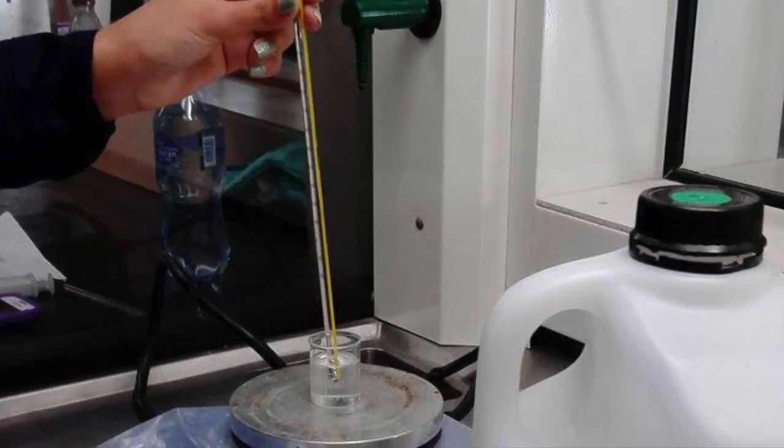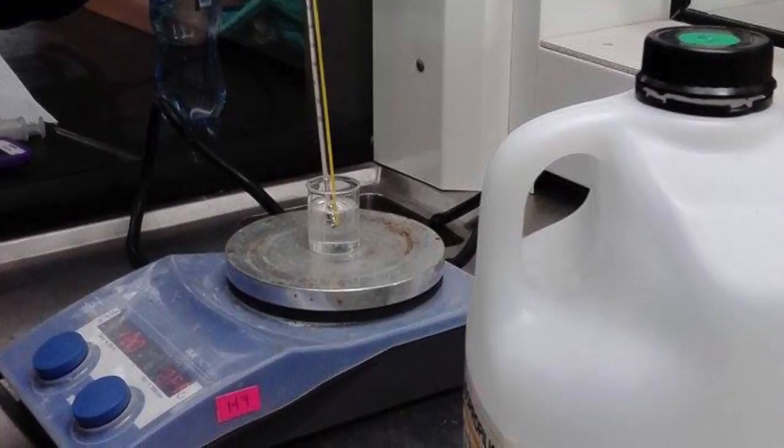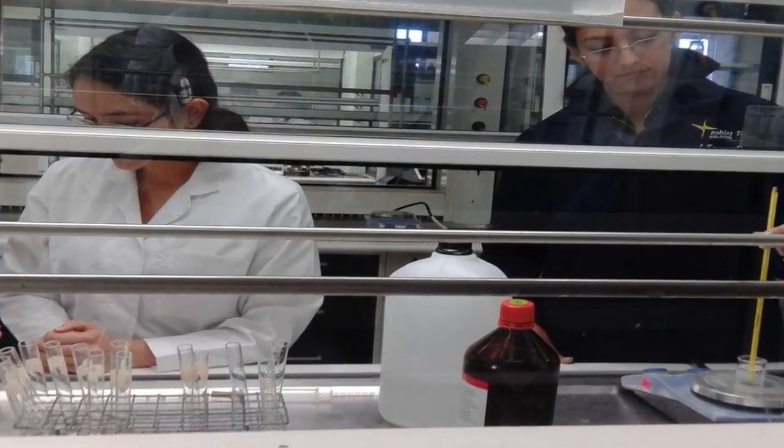Then the team took a sample of pure compound and checked the temperature of its ebullition point, experimentally and theoretically.